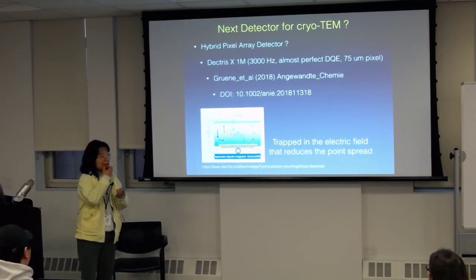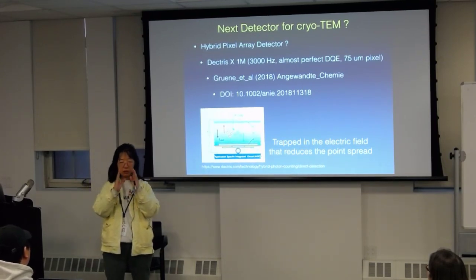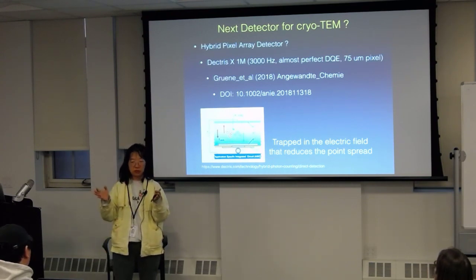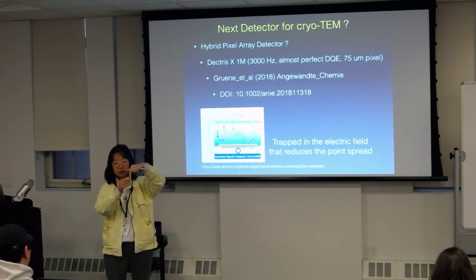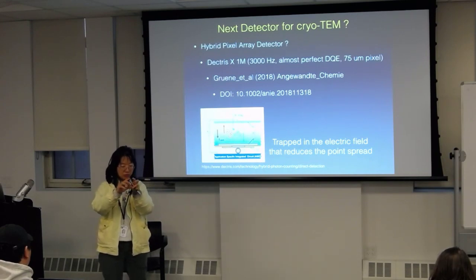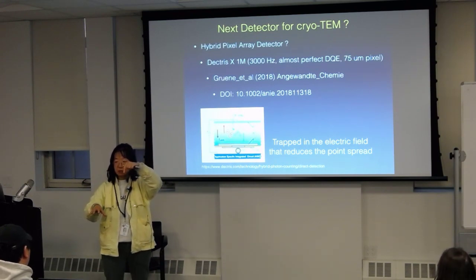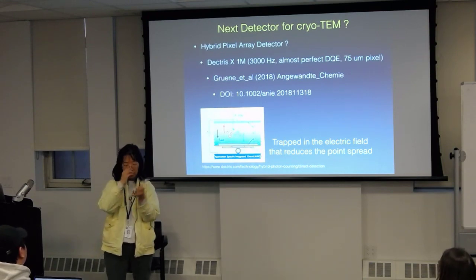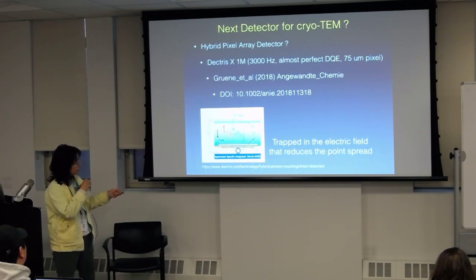Okay. The idea of this is that right now, the reason that we are not getting the best signal to noise ratio for all the frequencies is that when, say, an electron or photon comes in and hits the sensor, all sorts of things scatter out from the point where it hit, right? So I cannot capture it all by itself. What this camera does is that it has an electric field at the sensor part.